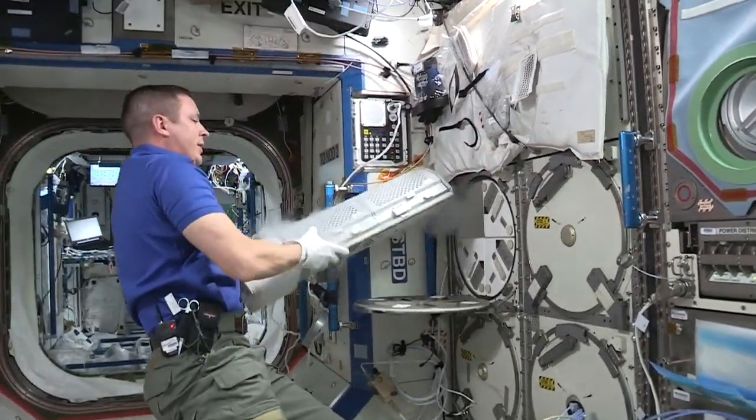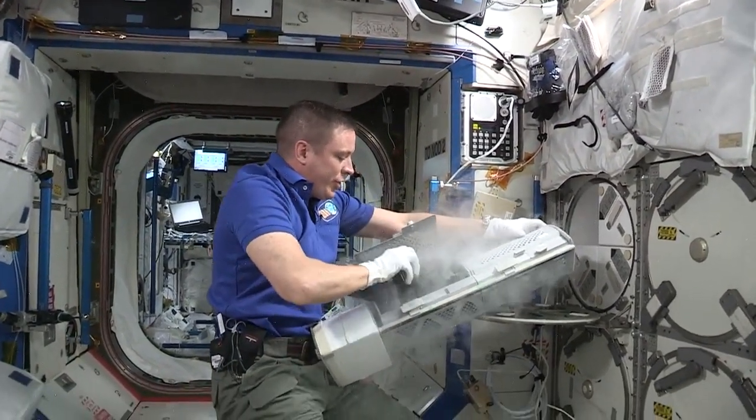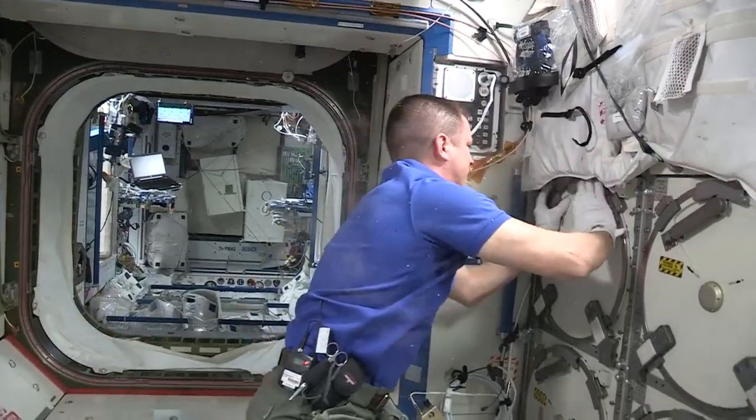To get samples back down to the ground, the MELFI cools down these wonderful little things called ice bricks, and then we put these in super coolers and send them back to the ground so that all of our science can be studied and hopefully we find some cool results out of our experiments.